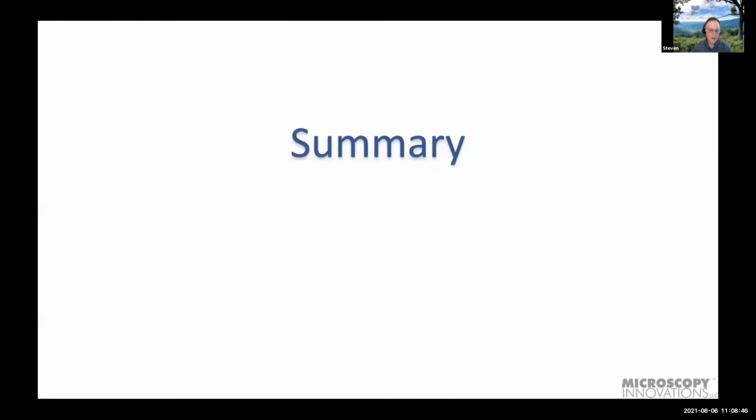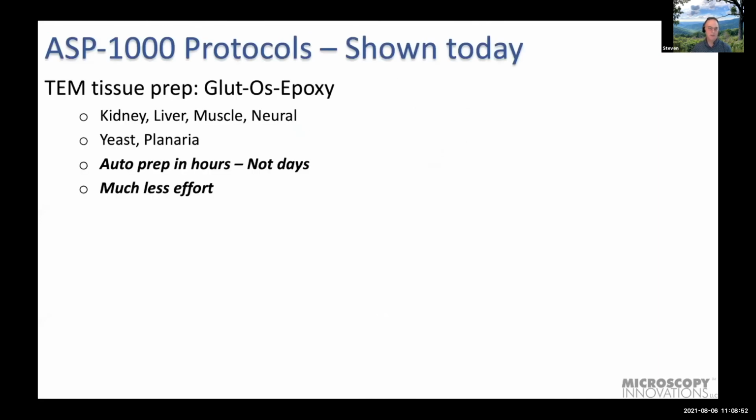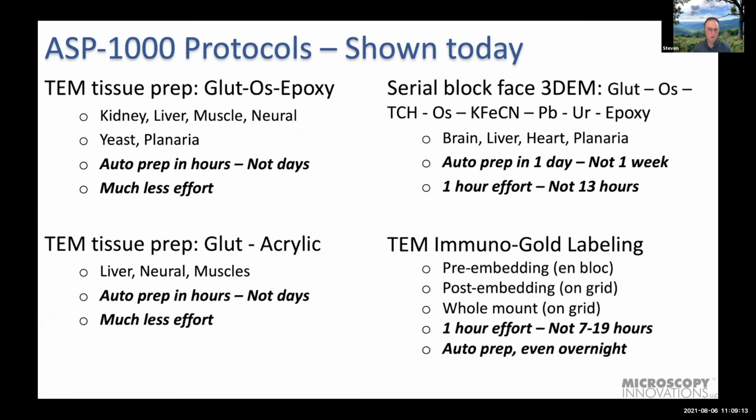So I want to summarize what I've shown today. We have demonstrated TEM tissue prep using kind of standard glutaraldehyde osmium epoxy preparation. We've demonstrated glutaraldehyde acrylic preparation with an acrylic resin. And we've demonstrated serial block face 3D EM prep, as well as immunogold labeling.